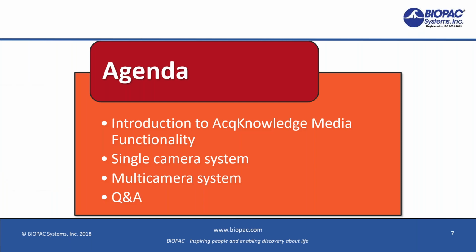In this morning's webinar, we're going to review everything from video camera setup, the actual hardware setup, and then look at different types of video options. There are a number of different ways of doing that, and we'll be paying special emphasis to synchronization, so making sure that the video is synchronized with the physiological data that you're collecting.